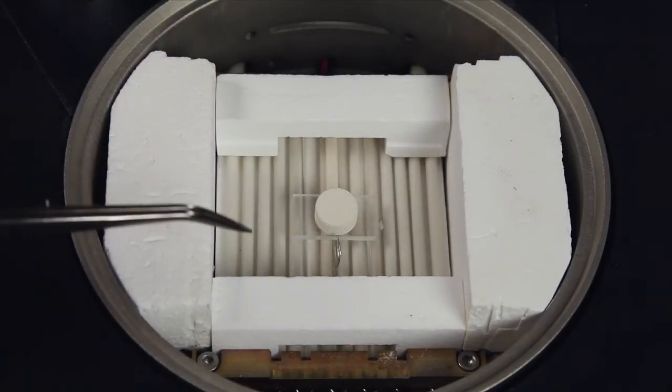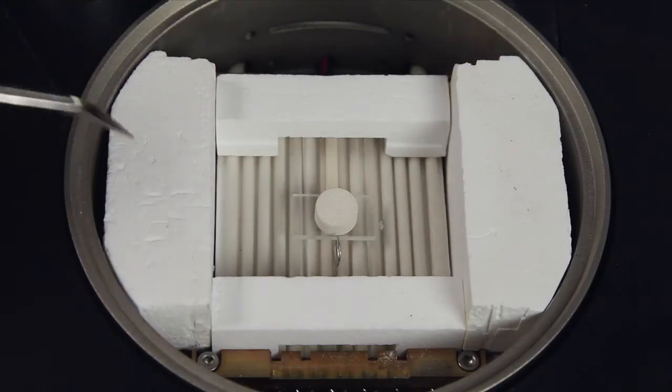The furnace can heat uniformly due to the existence of upper and lower planar heating units. The sample is located in the center of the furnace and surrounded by isolators. This eliminates both vertical and lateral temperature gradients.